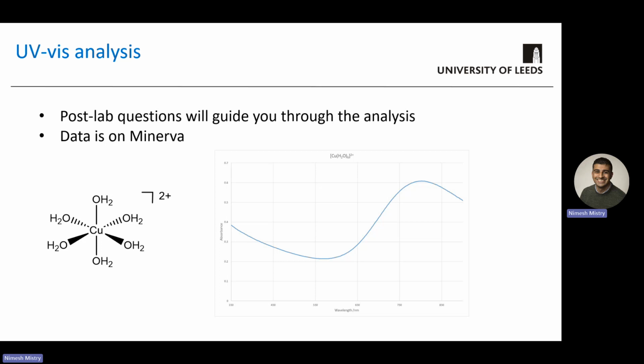Okay, so that's the summary of what you're doing for the crystal field theory experiment, and how the synthesis and the UV data link together to help you understand and analyze these types of copper complexes.